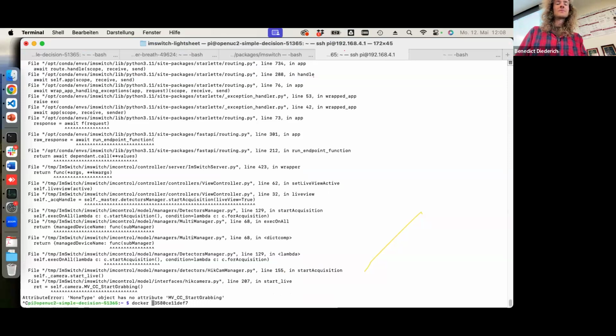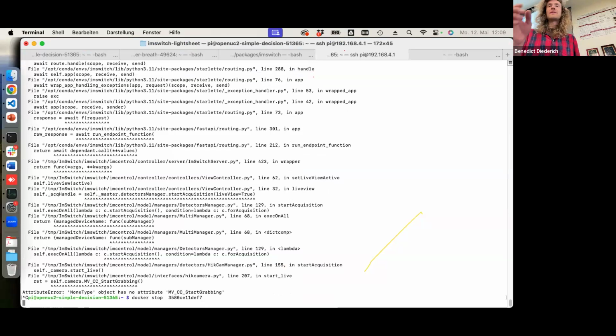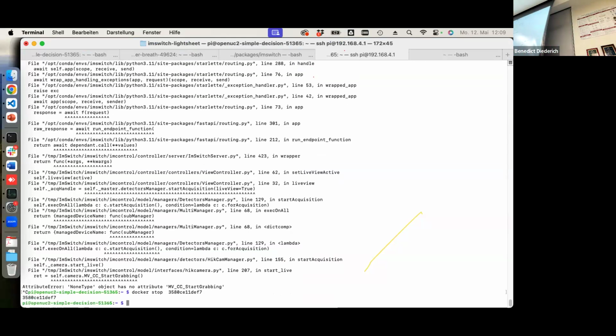The camera stops working when I turn on the laser. Turn on the laser first and then start the camera. I'm curious if the camera immediately shuts down. Or there's a mechanism to eventually reconnect it, which it looks like is also failing.